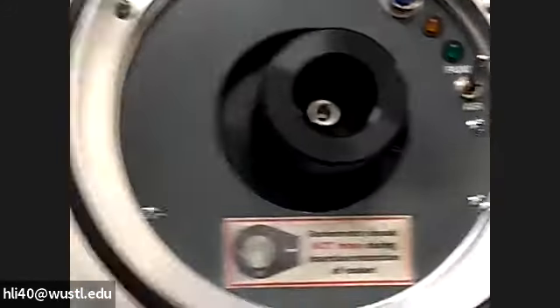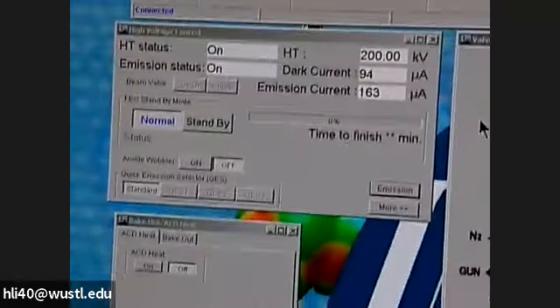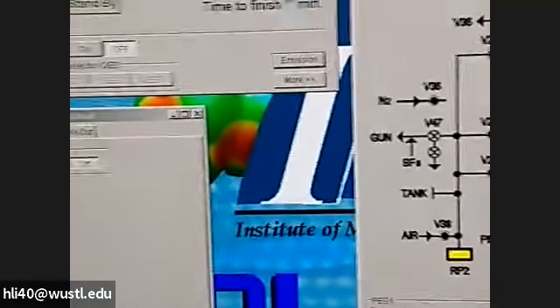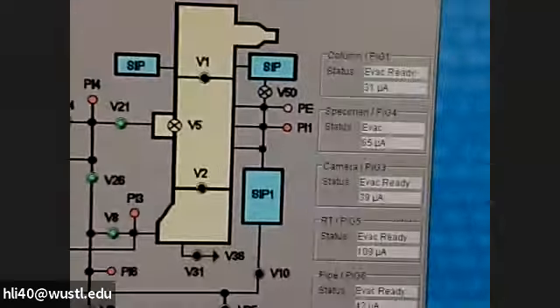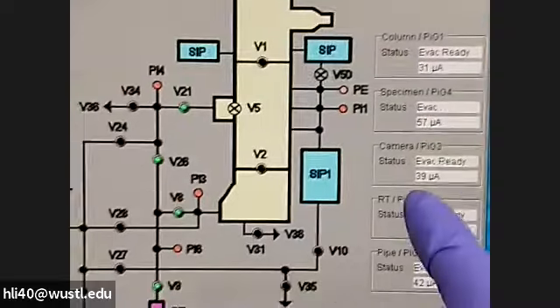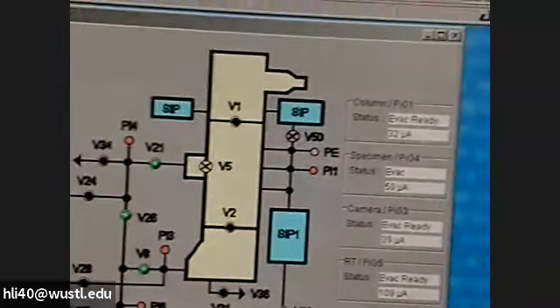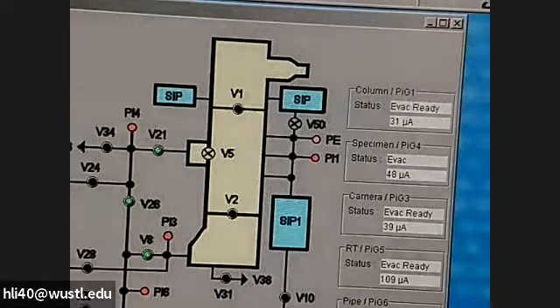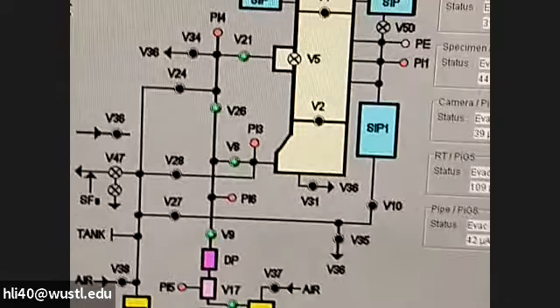After that, you just release your hand and wait for it to come to evacuated. For the dummy holder, it's not critical to go to evacuated, but for the real holder, we have to make sure it's evacuated. For the dummy holder, I would say when the value comes down to around 40 — now it's 54 — we are okay, safe to rotate and insert it. We wait another minute.